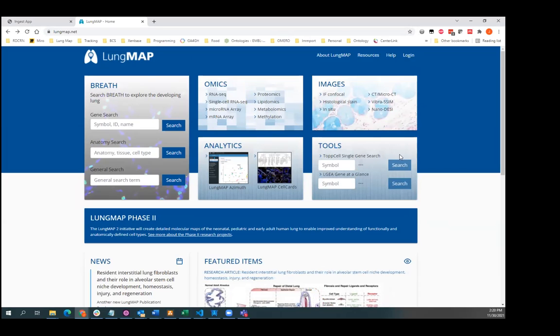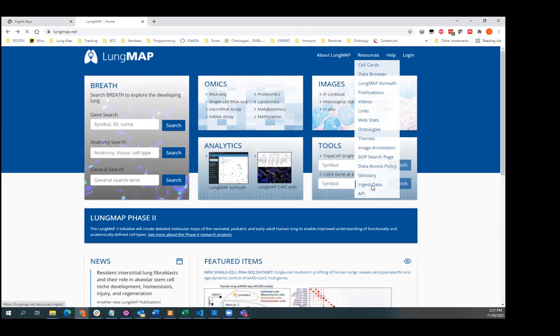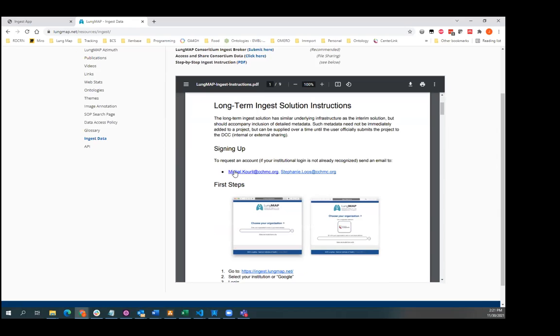A DCC member who is on, can you direct? That was correct, what you were just doing. If you go back there. Ingest data? Yep, and then here's the information here. And yeah, you can click on those links. Yep. Excellent. So here's the information.